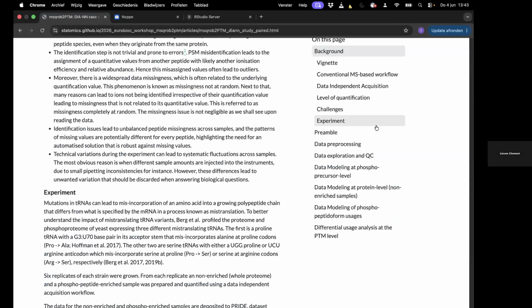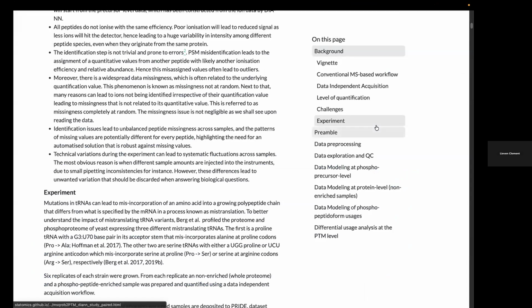Yeah, here in the first chunk I was caching the data from the web on the machine and established a link, and in the second phase with the arrow package you can read the Parquet file, and that is reading the Parquet file into the data. Can you connect to the file and load it as you request? Yeah, you can probably.